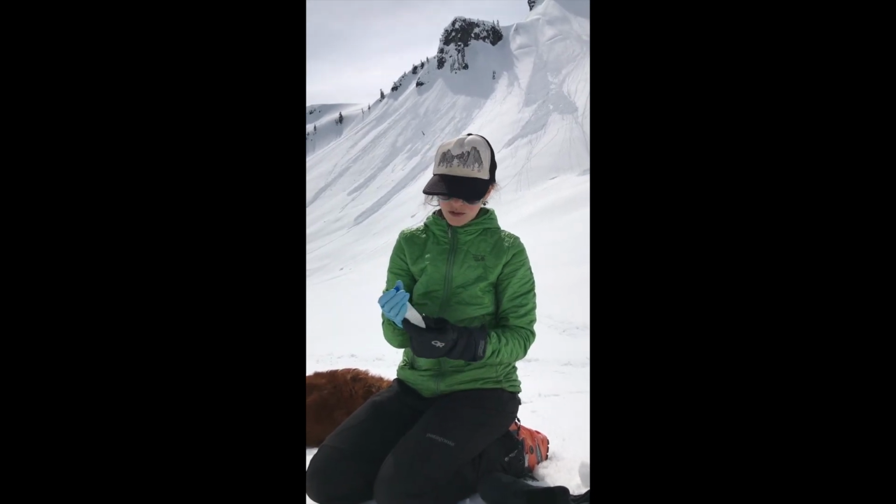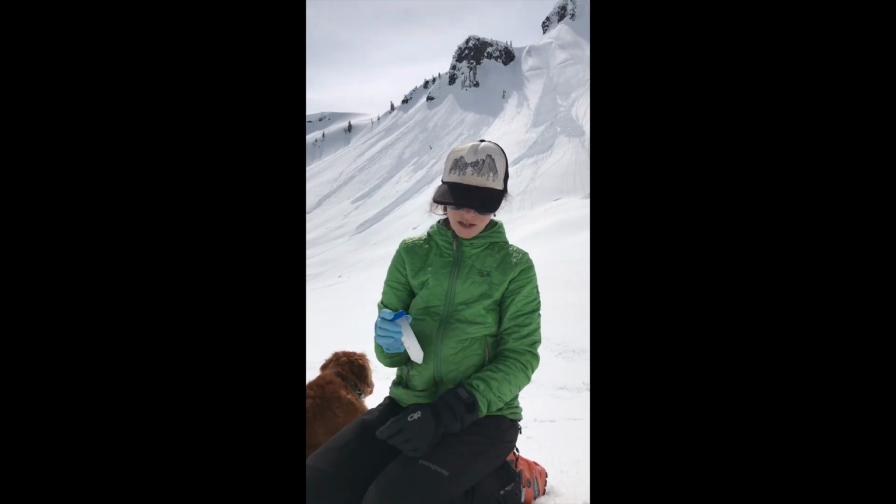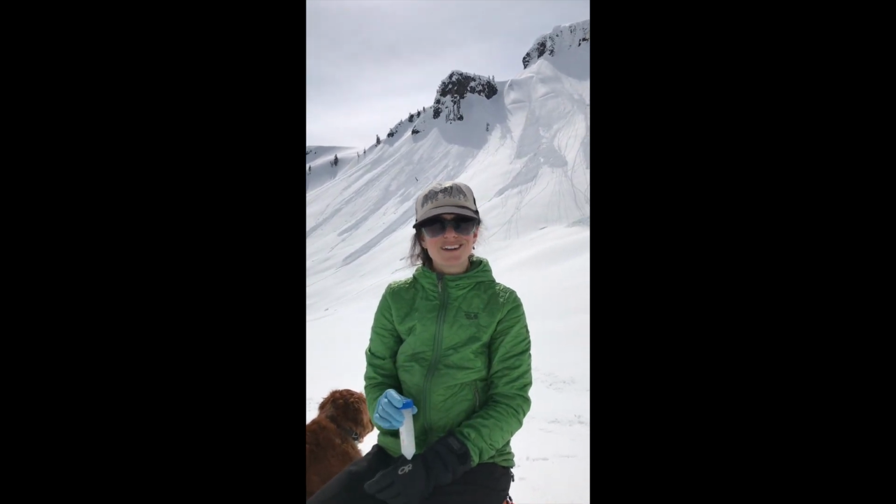If it's going to take a little while to get to a collection site, it can be in this solution for up to 2 weeks without being in the refrigerator, but it's also nice to put it in the refrigerator if it's going to take a little bit of time to hand the sample back in. And it is, again, non-toxic, so it's fine in your refrigerator.